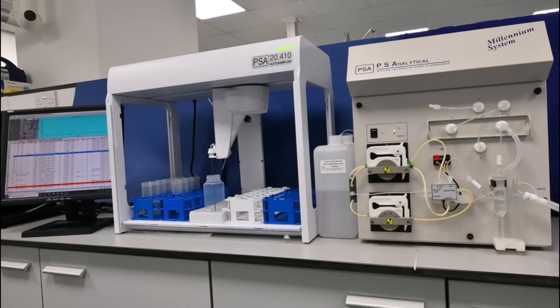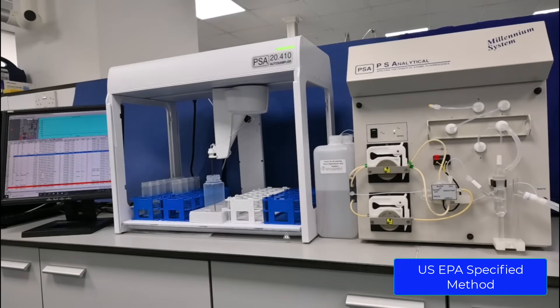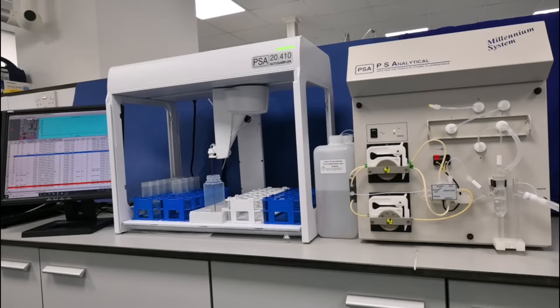Method 1631 is a US EPA specified method for the determination of ultra-low level total mercury in water samples, with a detection limit of 0.2 nanogram per liter. To conform to this method, PSA has configured its 10.035 instrument with a Galahad gold pre-concentrator.